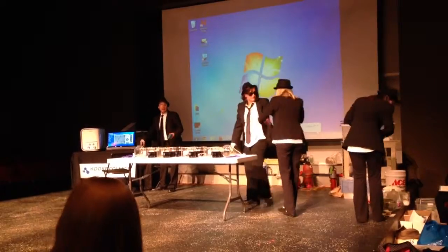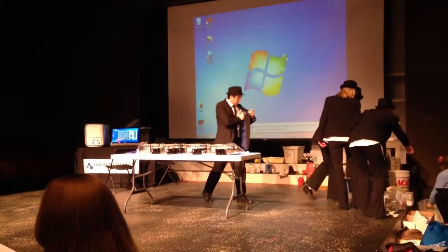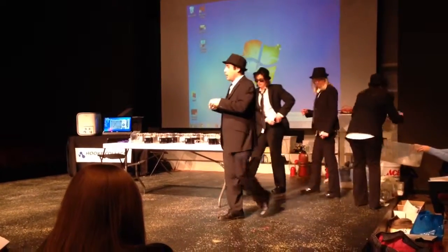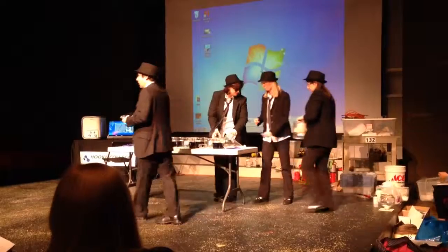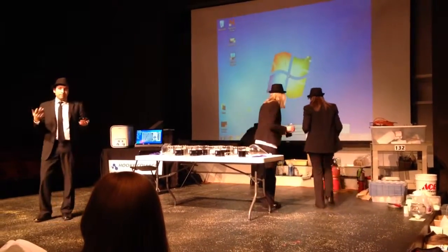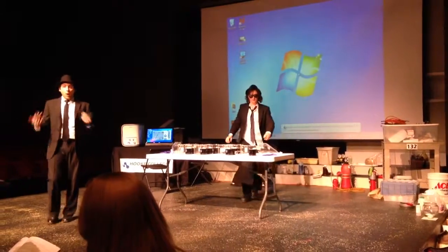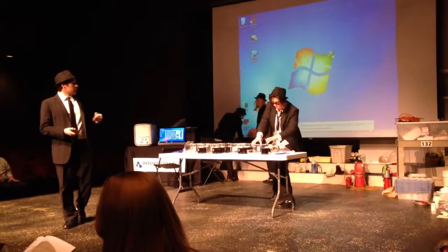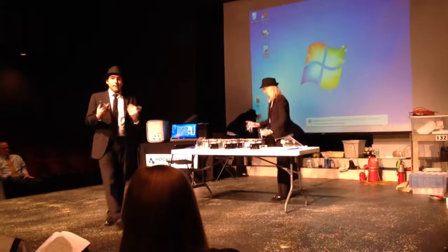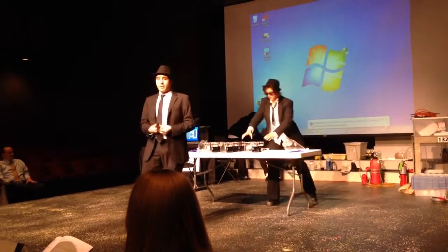So, iodine clock, I'm sure many of you have seen the iodine clock reaction before. We obviously like to have a little fun with it. The way we tend to use it at our school, we use it at the very beginning of the year to teach cause and effect and learn about what an experiment actually is. So we start by them creating a graph based on data that we've given them, or data that we predetermined for them to use.